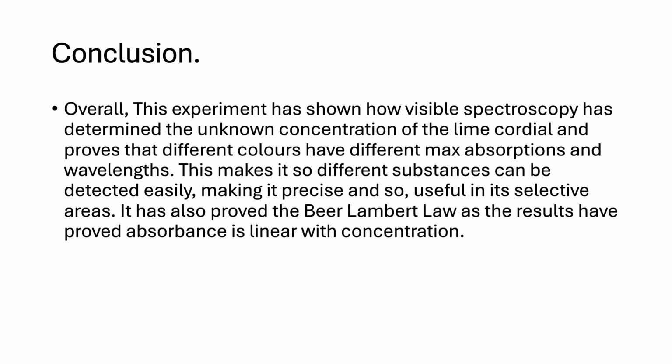So, with the experiment being concluded, it has shown how visible spectroscopy has found out this unknown concentration of the lime cordial, and it has also proved that different colours within the spectrum have different max absorptions and wavelengths, which allows them to be verified on what they are.